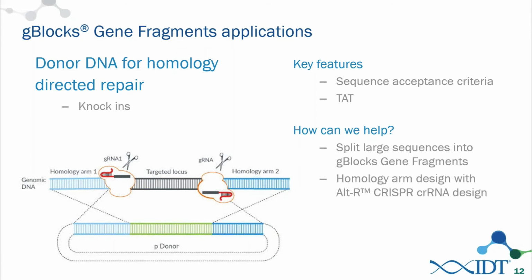Absolutely. So the next thing is, I'm actually going to read the statement before the question that's written in the reverse order. This person says, I work in bacterium which has a high GC content, and then 70% is the number in parentheses, but have generally avoided G-blocks gene fragments for, looks like knockouts, due to the problems associated with GC content.